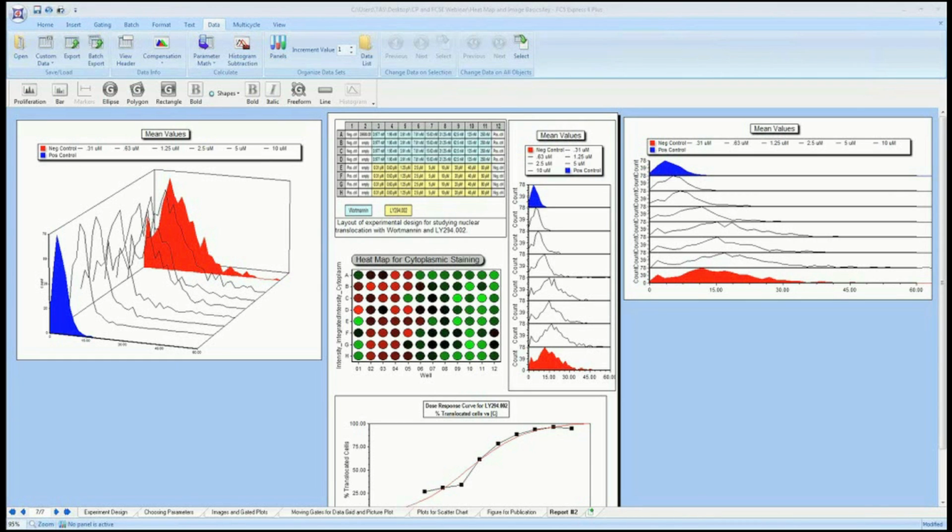But lastly, we have announced our own image cytometry format. We can provide documentation on that. If you're working with software and you're able to write out in that format, we will always be able to import that standardized format. And it's a format we're putting out in order to make it easier to work cross-platform.